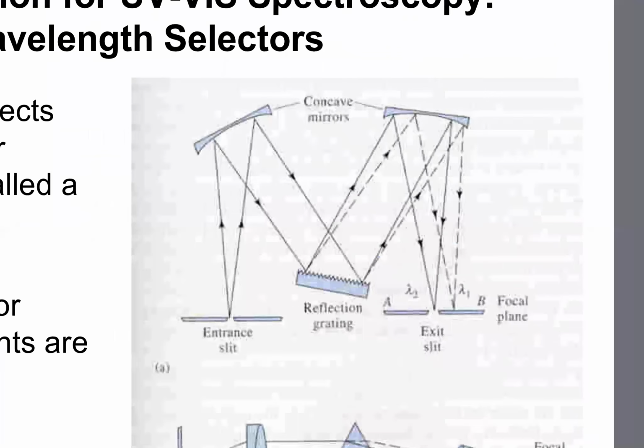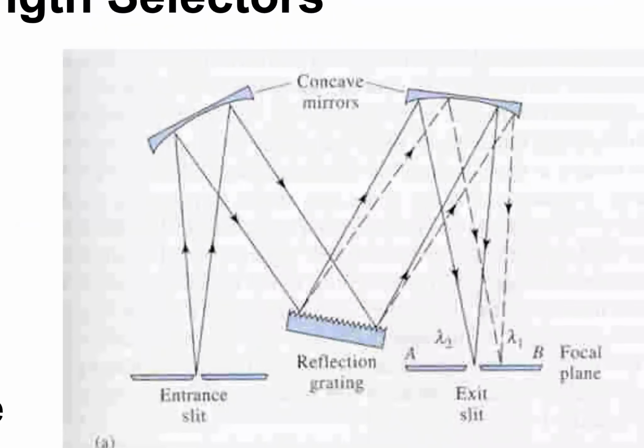Now, the second type of monochromator is based upon a diffraction grating. And this one, in my experience, is more popular, more commonly encountered. Has some similar parts. Okay, so down here we're going to have our light bulb, my light bulb producing light. Okay, we're going to pass the light through the entrance slit. Again, that makes a point source.